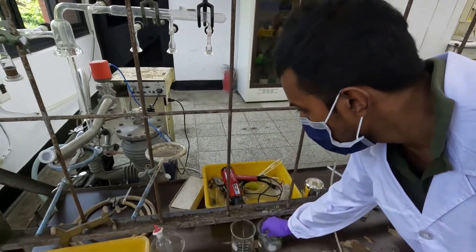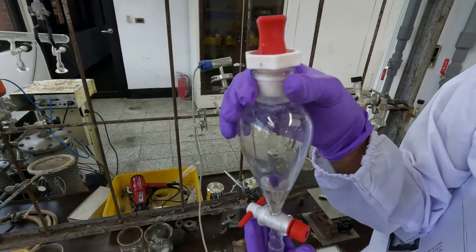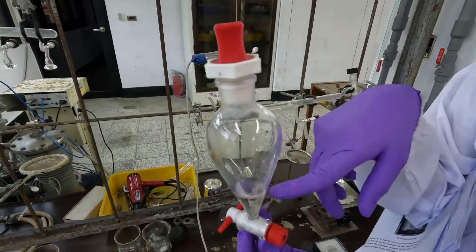After that, you have to measure 5 ml of sulfuric acid into a dispensing funnel. You can see it here.